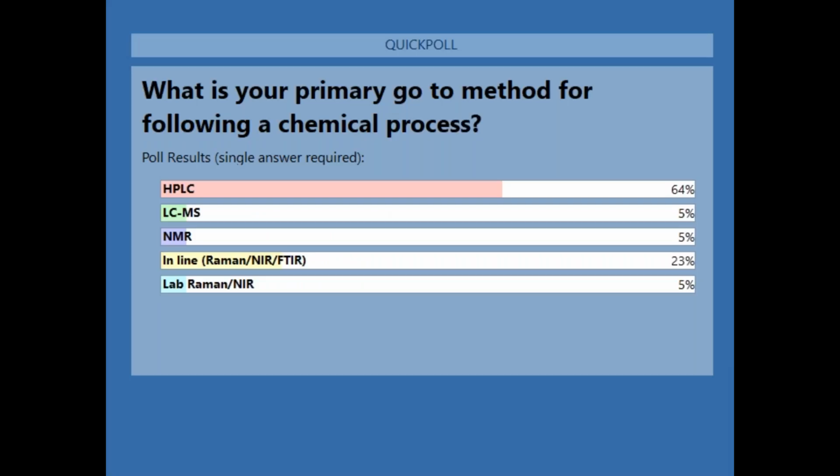Thank you for your participation. The most popular primary method for following a chemical process seems to be HPLC.